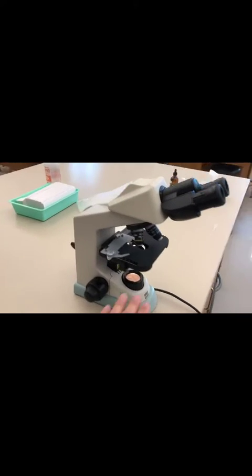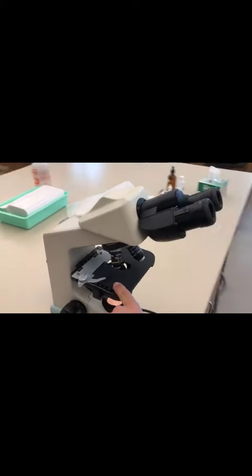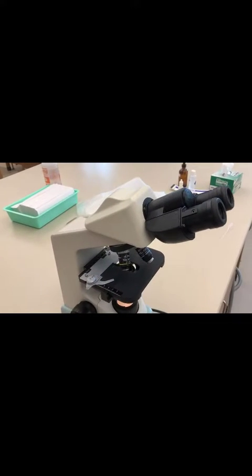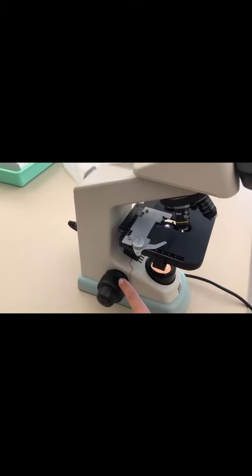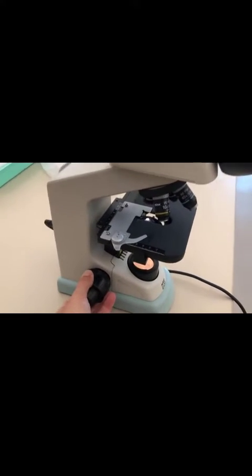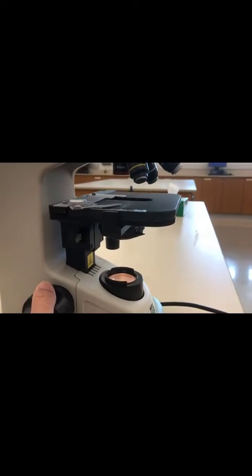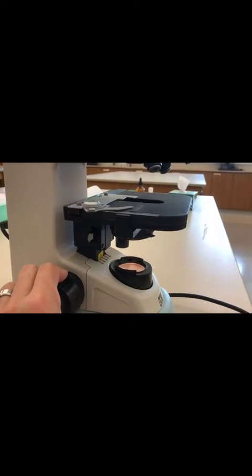Now you've got the microscope on. You want to make sure that this stage where the specimen is going to sit is all the way down. So you're going to turn this knob, the coarse adjustment knob, until the stage goes all the way down. You always want to start that way.